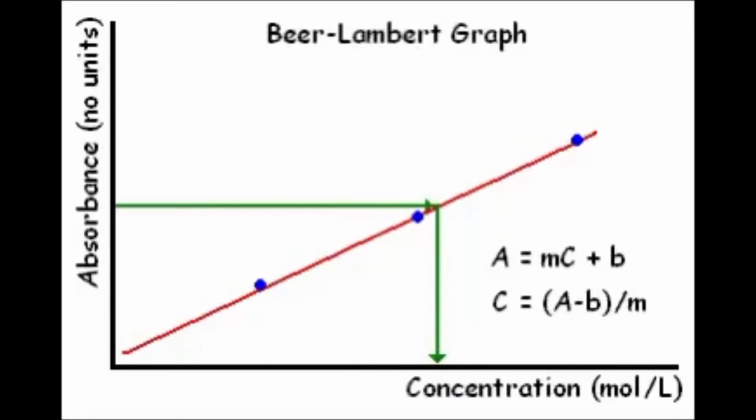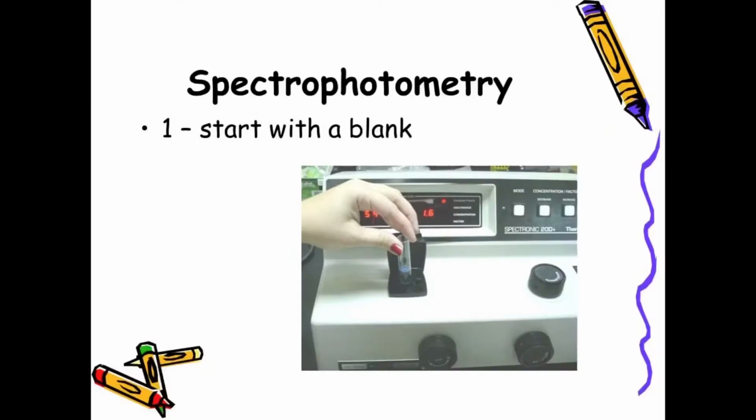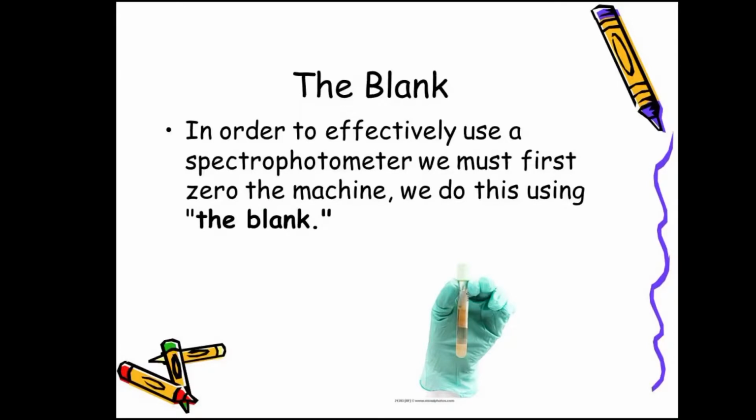The relationship between absorbance and concentration is directly proportional. The absorbance of the light absorbing matter in water is directly proportional to its concentration. You must be careful to remember to zero the machine with a blank before scanning for the absorbance value because it negates the effect of the water molecules and solely takes the absorbance of the solution's concentration into consideration.